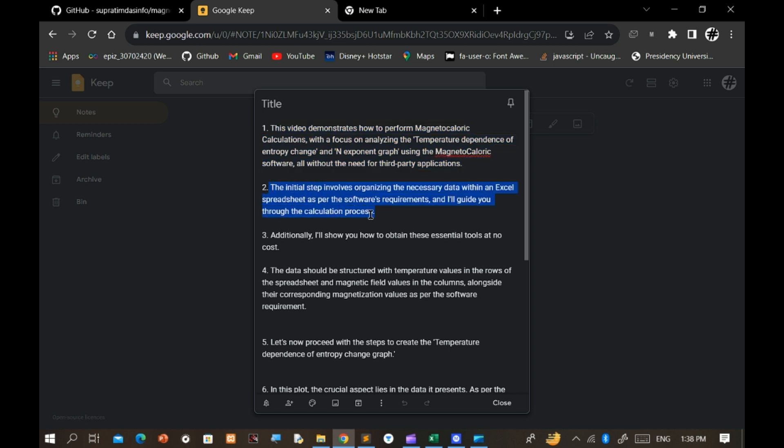The initial step involves organizing the necessary data within an Excel spreadsheet as per the software's requirements, and I'll guide you through the calculation process. Additionally, I'll show you how to obtain these essential tools at no cost.